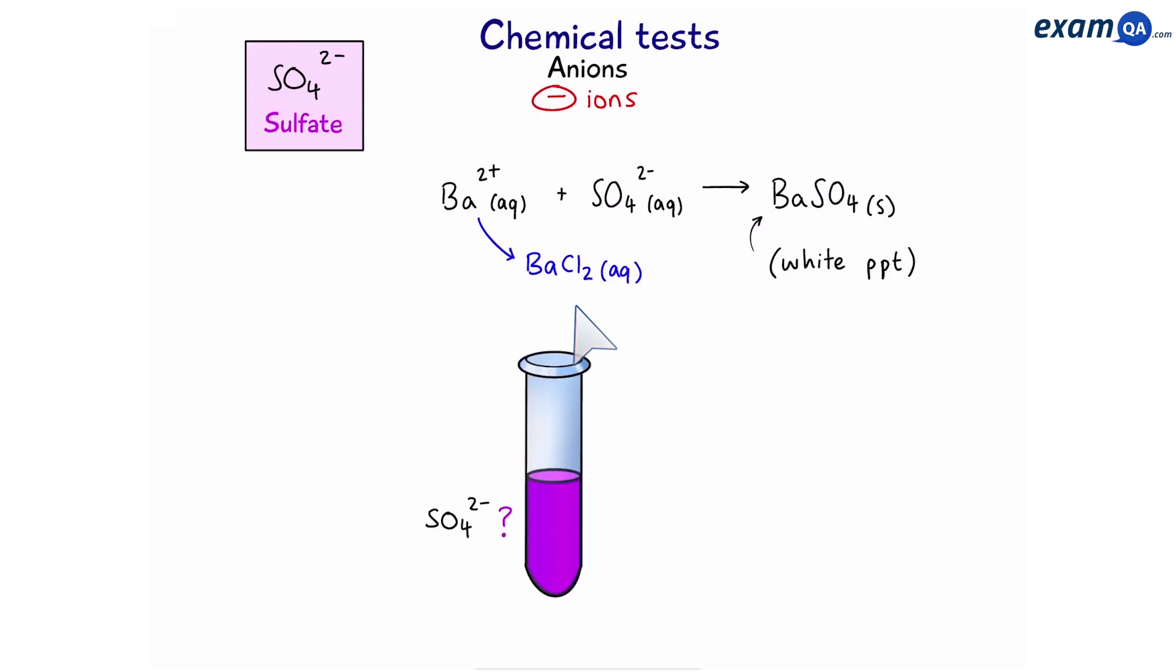So we have a mystery solution and you want to know if it contains sulfate ions. Now before you rush in and add the barium chloride it's important to note that there may be some unwanted impurities such as carbonates and sulfites. If we added the barium chloride and these impurities were present they would also create white precipitates and we'll get a false positive.